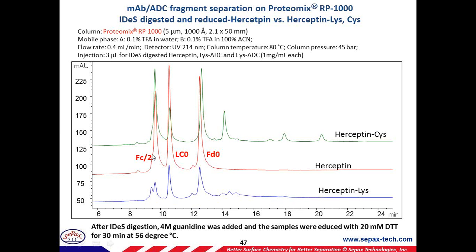So you can see probably the Fc portion is also conjugated in this case, because it splits into 2, and you have more of this peak here. So it would be nice to continue to characterize them with mass spec to see those drug conjugates.